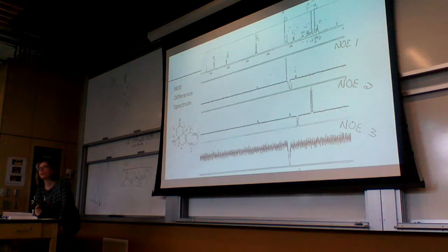Yes. Dylan, can you say what the negative means again? The negative is just the peak that we are irradiating. So we're giving the radio frequency at exactly that radio frequency, and so they're very excited. And we're just looking at the little effects of the other ones.